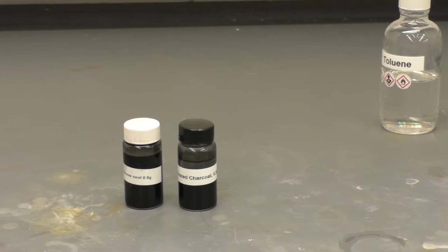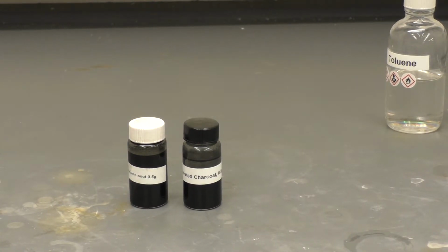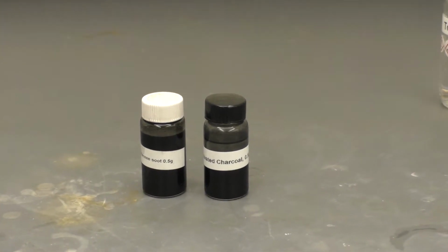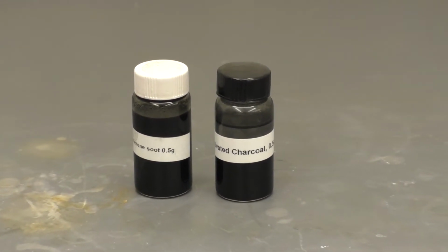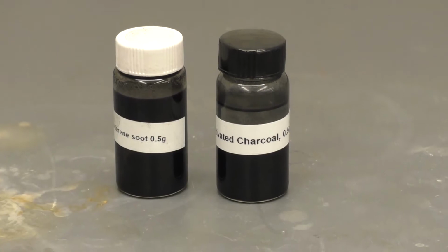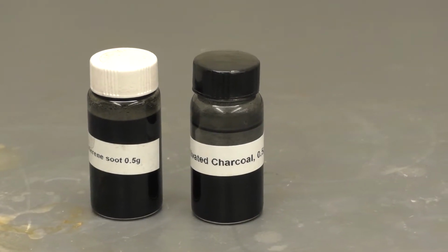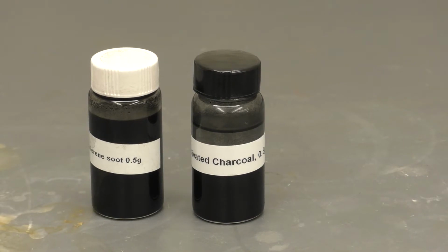So now that we have shaken them up, there's just some sediment. They look really black if I zoom in. And what we're going to have to do is wait a while so that if there's any solid, not dissolved but floating in solution because I shook it up, it'll settle out. And I think actually you can look at the charcoal, you can see it looks kind of colorless and clear on the top. So let me bring that up.